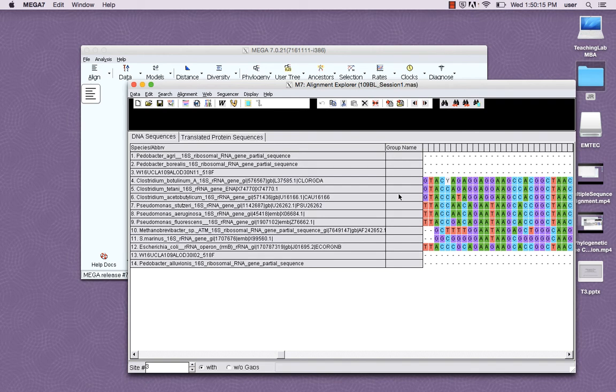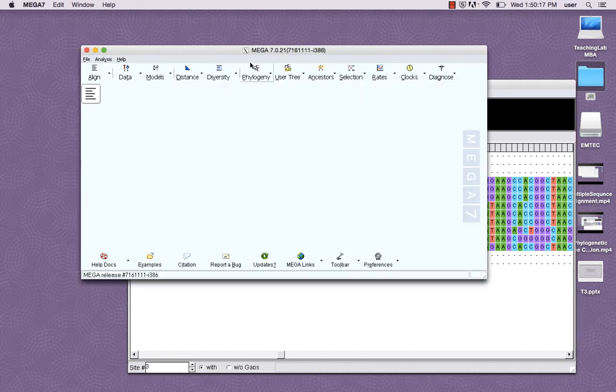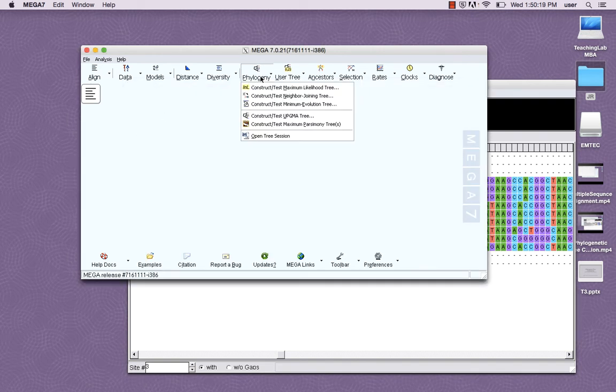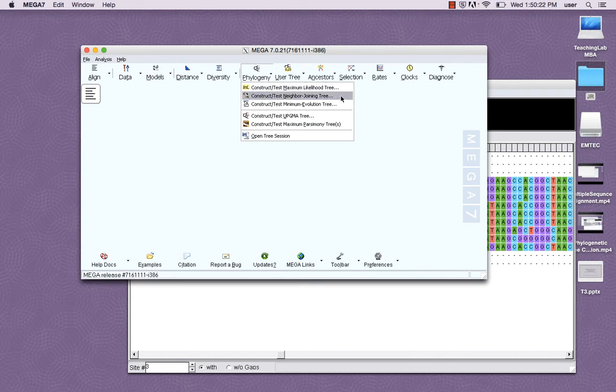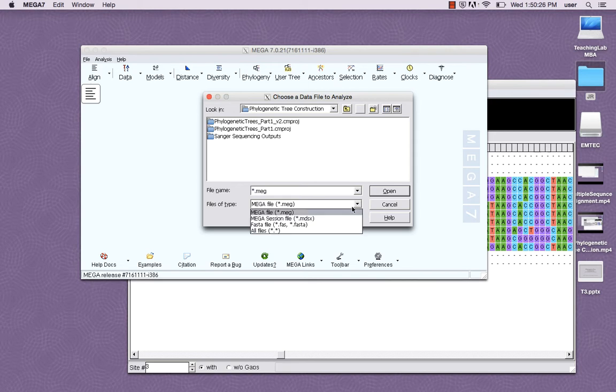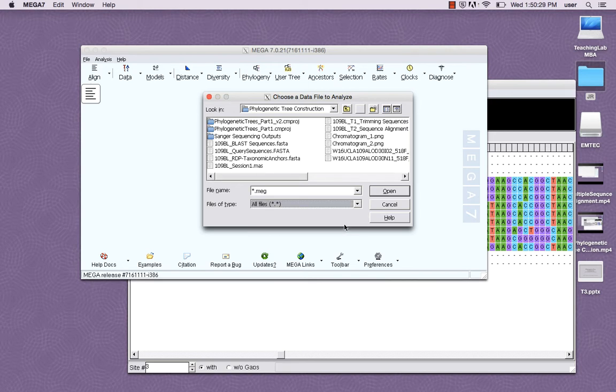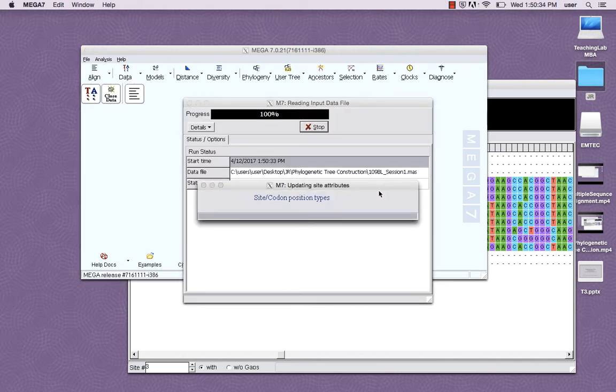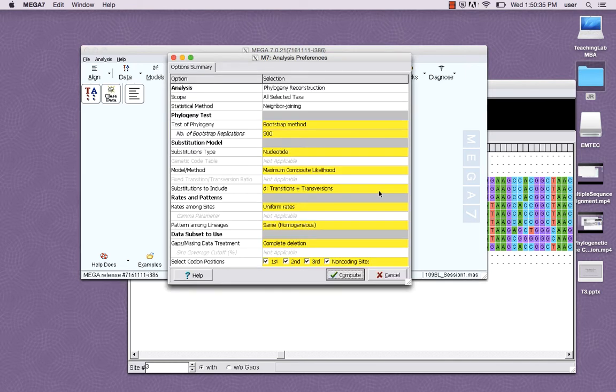Now navigate to the main MEGA window, click on phylogeny, and construct a neighbor-joining tree. In order to select the alignment session you just saved, you have to specify all files in file type. Once you've selected your alignment session, a new window will appear asking for your analysis preferences.